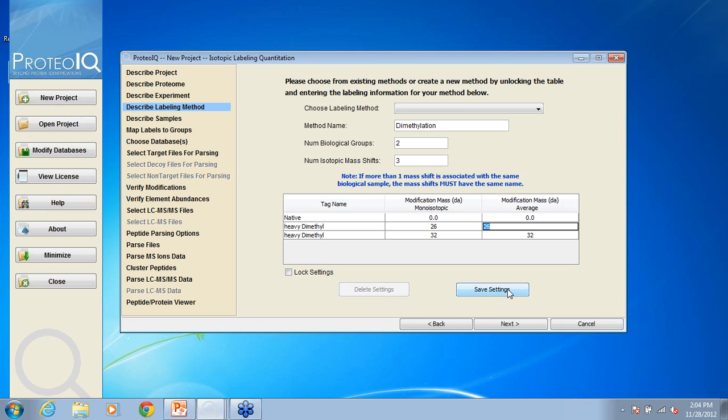All right, do we have any other questions? Yeah, Eduardo asked any specific advice on when to upgrade to 2.6, and in relation to 2.3, should I do a BKP? Oh, backup of databases. What do you need to back up when you're going from 2.3 to 2.6? I always recommend doing a backup of your databases just in case. This is a direct install. It'll install right over. It should save all your databases and everything.